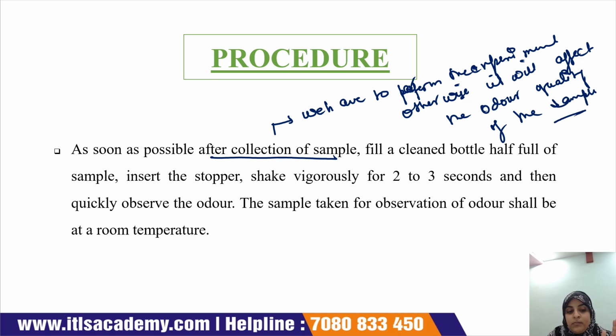Okay, now what should we do? Fill the bottle with the sample, and half the portion should be filled. Now insert the stopper and shake it. We take this bottle and put the sample into it. And this bottle is already cleaned with hydrochloric acid and odorless distilled water.